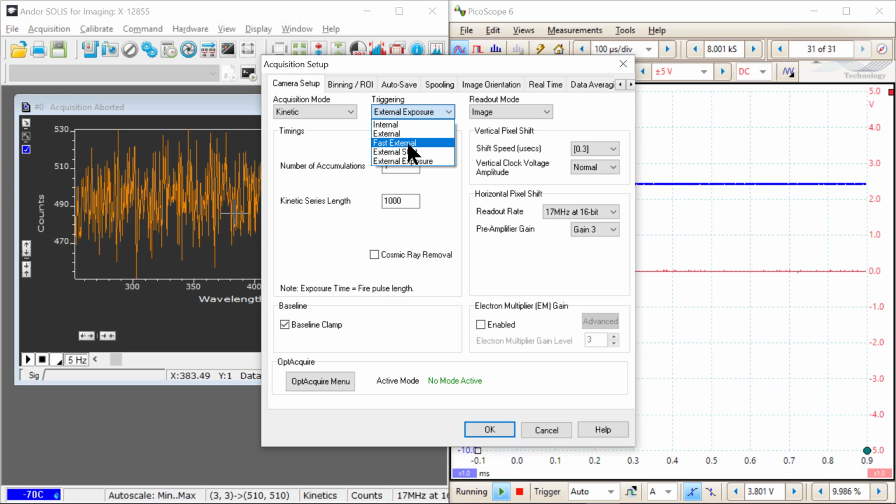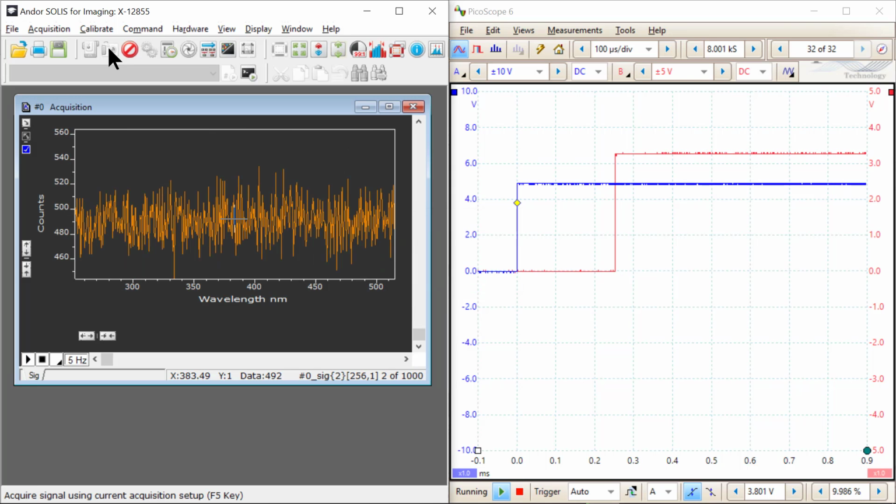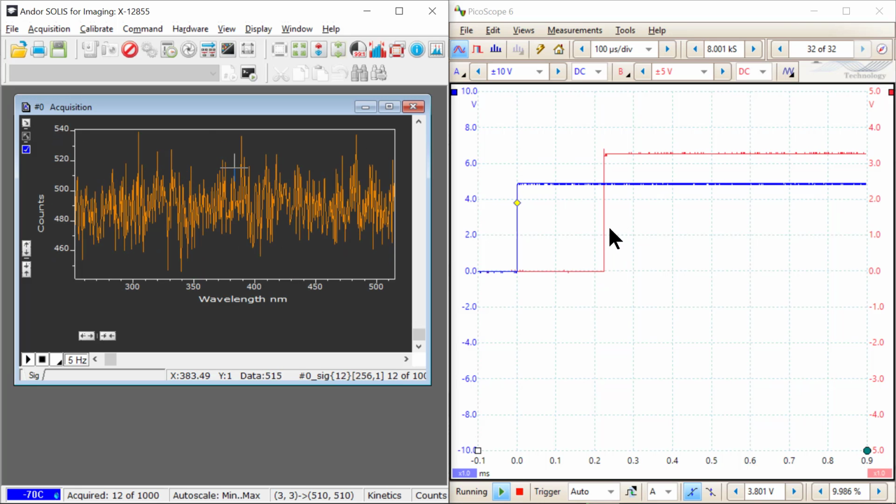And one other thing in this video, I might record a couple more parts to this, is the jitter involved in the keep clean cycle. So if I were to go back to, let's see, external triggering, we're going to use frame transfer mode, we're going to use non-frame transfer mode, you can see that there is an indeterminacy in when that exposure actually starts.